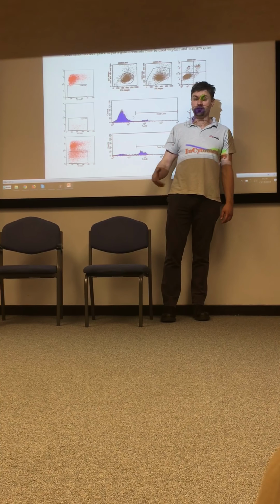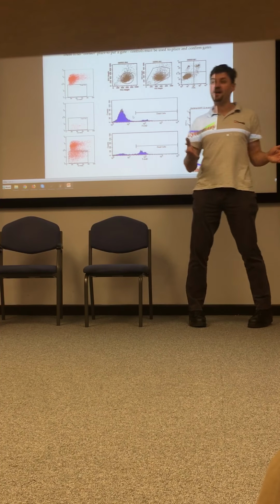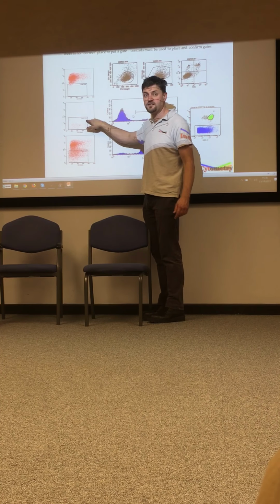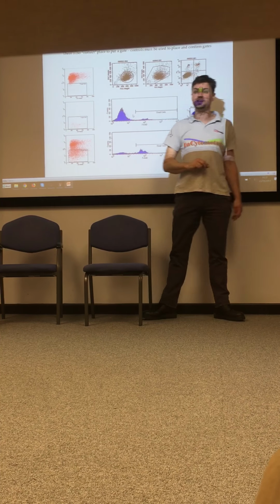If I'm at a cytometry conference, I'm going to get laughed at, because you can't put a gate there just because it looks about right. Now I do that when I'm doing quick analysis, but that's years of experience. However, if I had a slide that said, when I ran target cells only, I got this, and when I ran NK cells only, I got this, so by putting the gate there we got optimal differentiation between them.